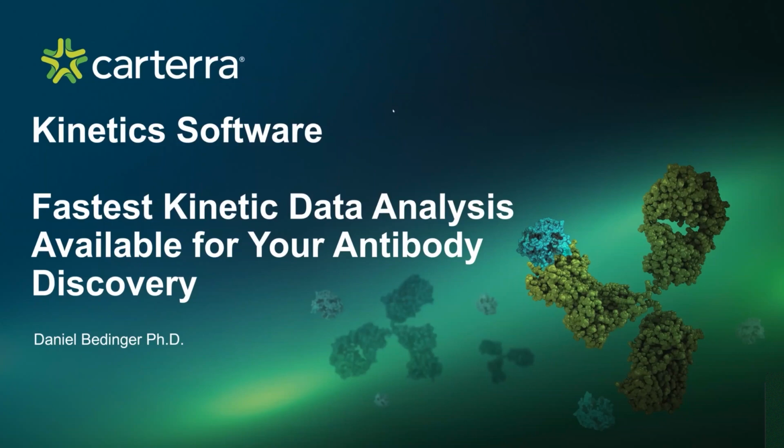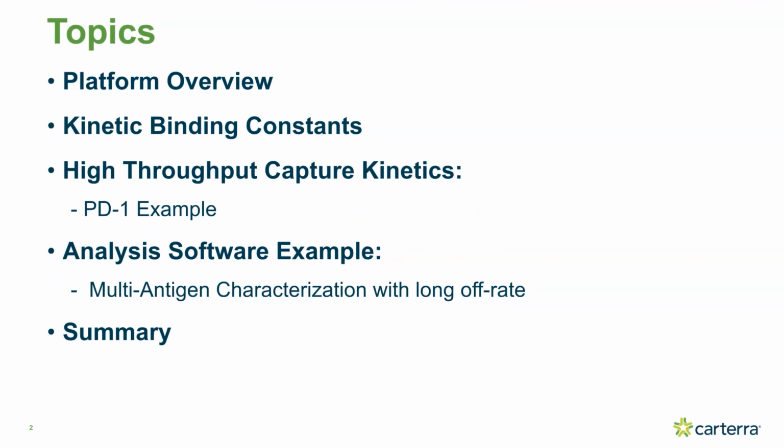Thank you all for joining us today for this talk. So I just want to give a brief overview of the topics I'm going to cover today. We're going to start with a platform overview of the LSA, and then a brief discussion of what kinetic binding constants even are and why we measure them, and then talk about two examples of high throughput kinetics analysis. The first one being an example again of anti-PD-1 antibodies, and the second example, it will be a multi-antigen characterization with long off rates, and then we'll end with a little summary.